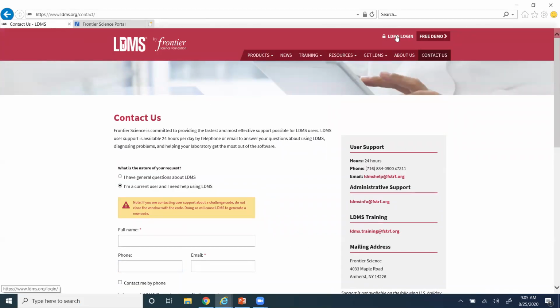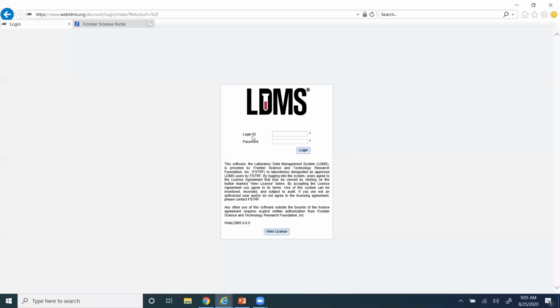I'll go ahead to the top using my LDMS login and log into the application, and we'll go through the shipping process. I'll do this at the beginning so you can refer to this video again and have it at the start so it's readily available.